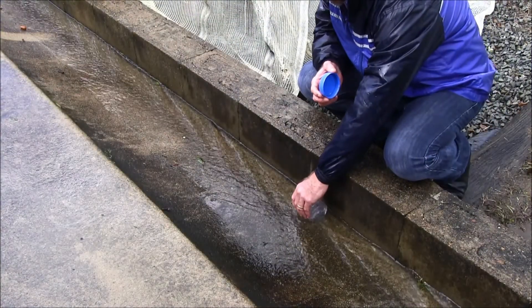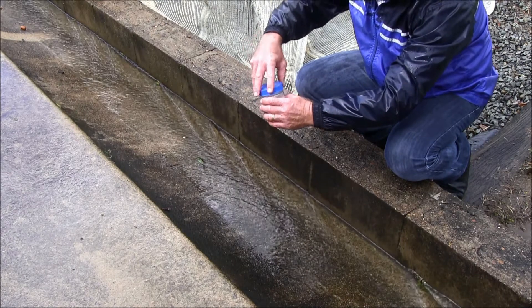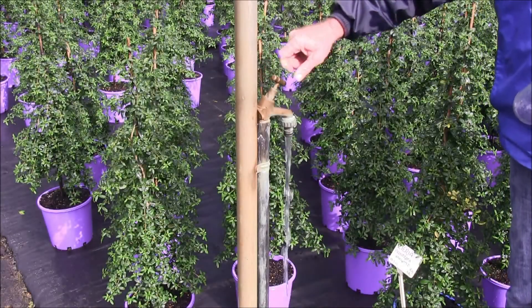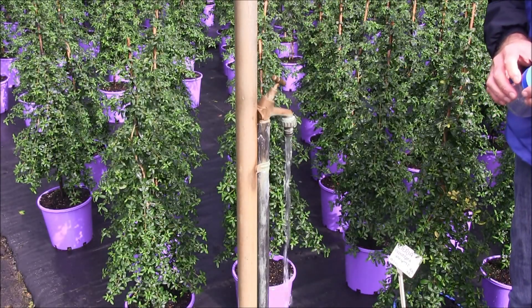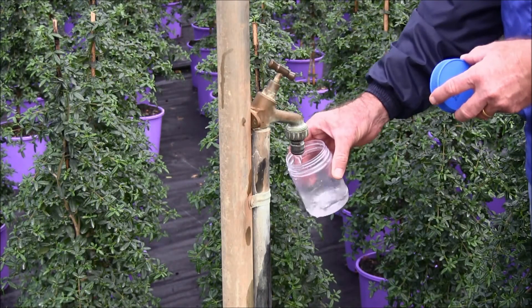For drainage water, the sample collection container should be rinsed three times and aeration minimised when collecting the sample. Pumps or hoses should be run prior to collecting the sample to ensure the sample is representative of the water source being tested.